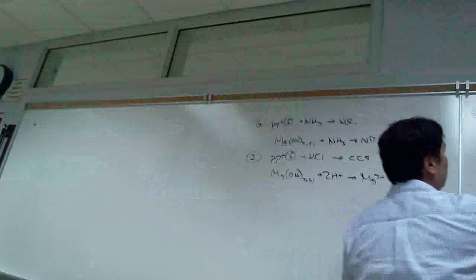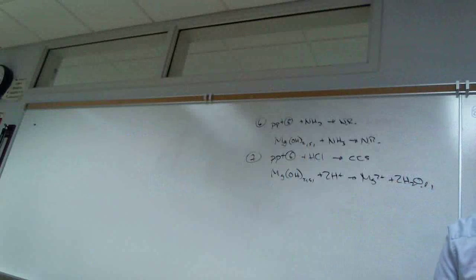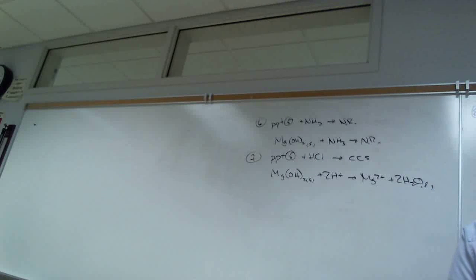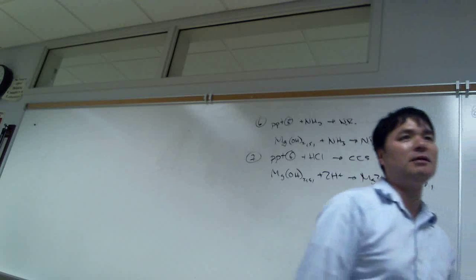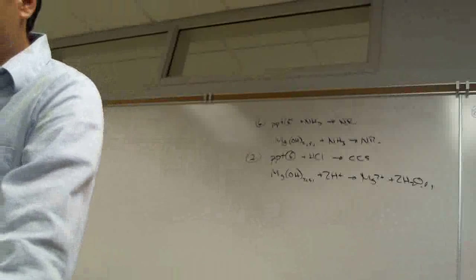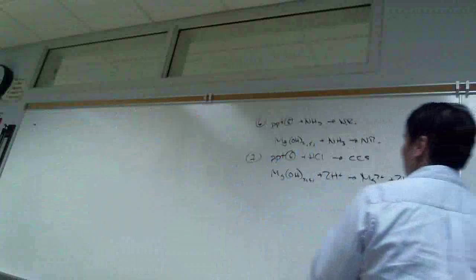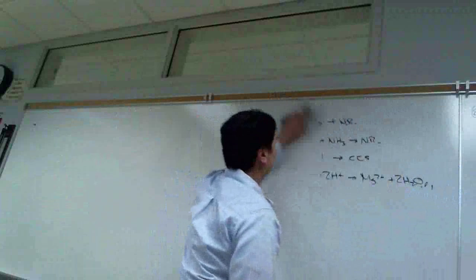So what is the reaction here? The reaction here is magnesium 2+ plus 2 hydroxides. Now the magnesium reagent is like the aluminon. You know, it's just a dye to color the precipitate. And it's a very selective dye. That is, it binds to the magnesium. And so what we end up forming is magnesium hydroxide, which has been contaminated by this dye, so now it's blue rather than white. And so this is the positive test for magnesium 2+. I went out of order, but it's okay.